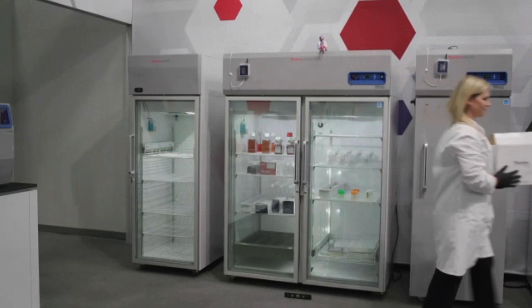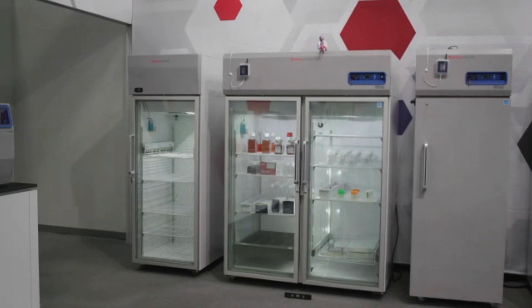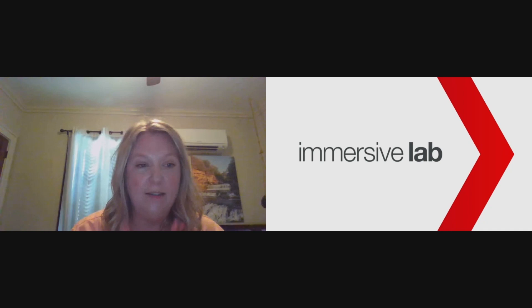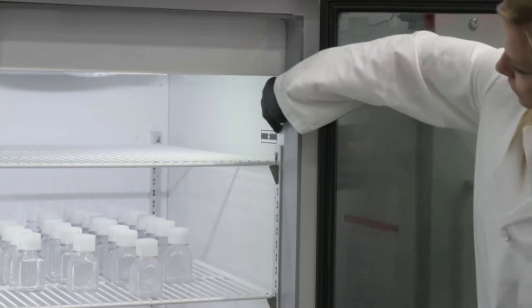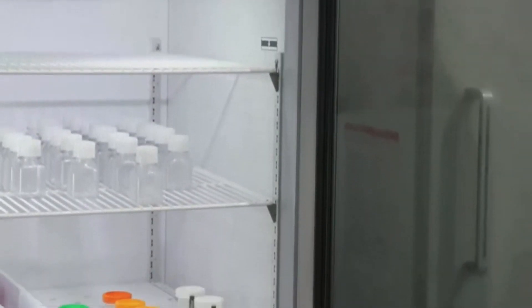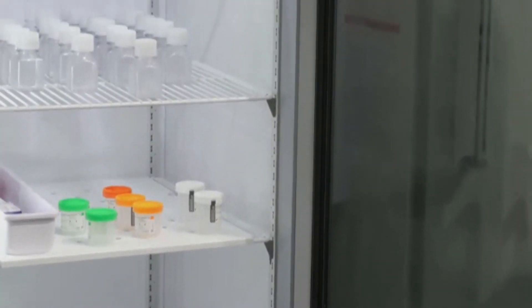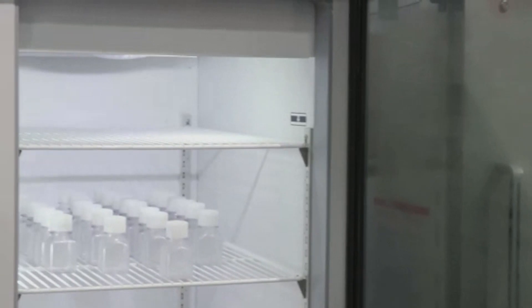Inside the refrigerator, we want to distribute the stored products as evenly as possible and load the product below the load line. You want to ensure there's space between the products and between the products and the walls of the unit. The load line is a marked line inside the refrigerator and freezers so you know where to load it — and as you can see, it's nice and evenly spaced to allow for airflow.